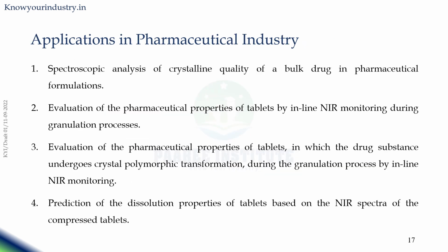In addition to the several applications we have already seen for IR spectroscopy, like identification of compounds and structural elucidation, IR spectroscopy is also used to analyze the crystalline quality of the bulk drug in pharmaceutical formulations.